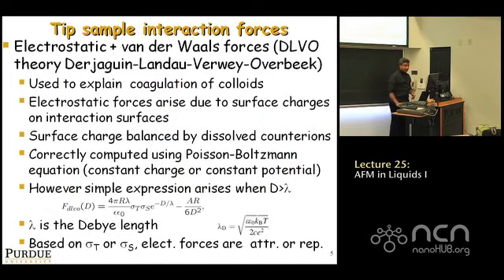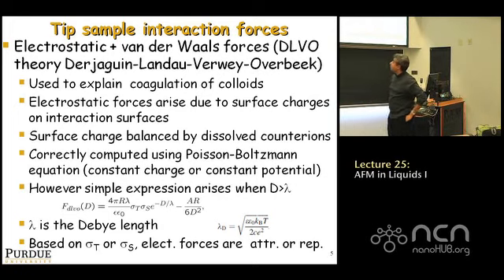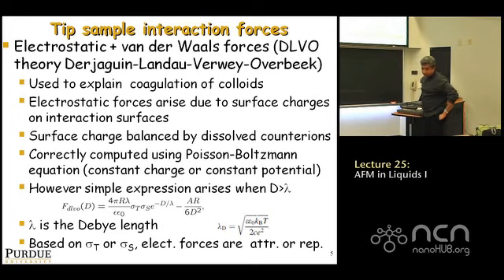All right, so we'll talk a little bit about what the interaction forces of relevance are when you go to liquids. Probably the most important ones are electrostatic and van der Waals forces in liquids. Now, the key theory that helps explain this is the DLVO theory. We talked about this when we did interaction forces. There was some discussion about DLVO forces, I believe, and I've probably done it in more detail then.